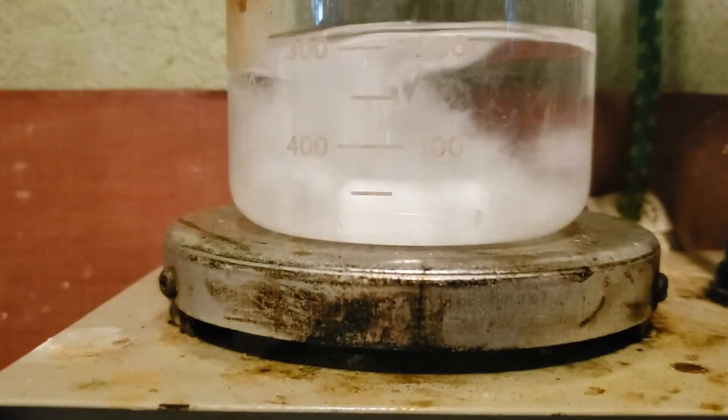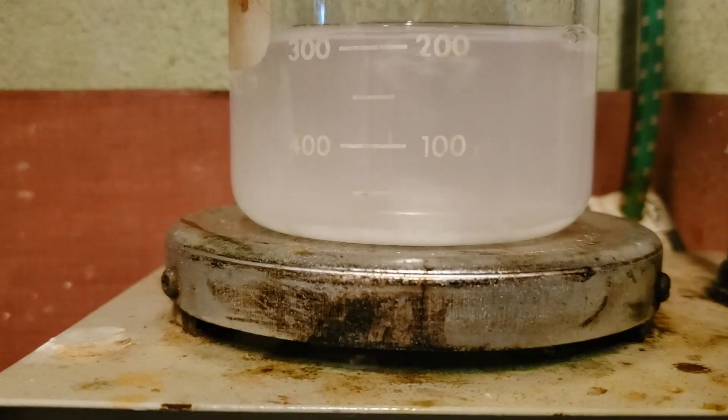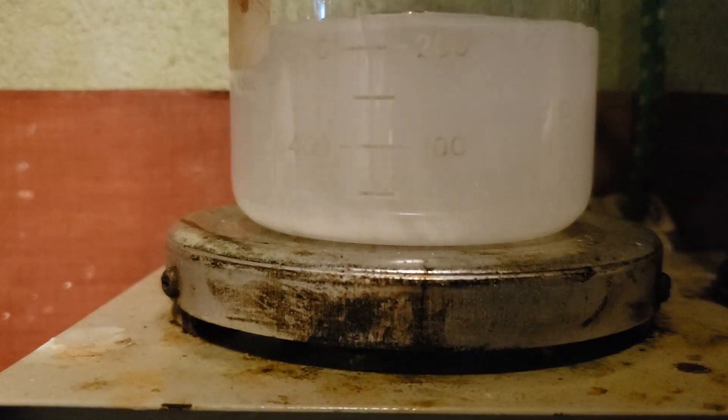Next, a solution of 10 grams of ammonium heptamolybdate in 200 milliliters of distilled water is prepared.